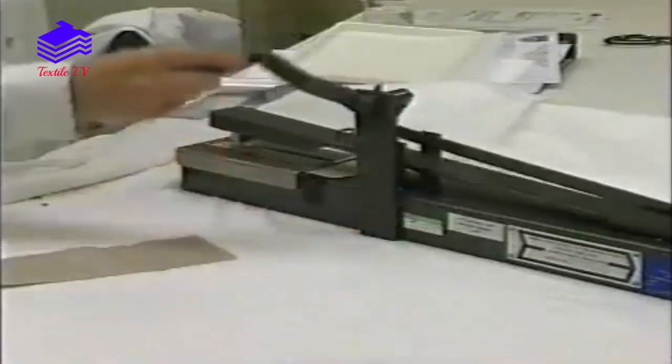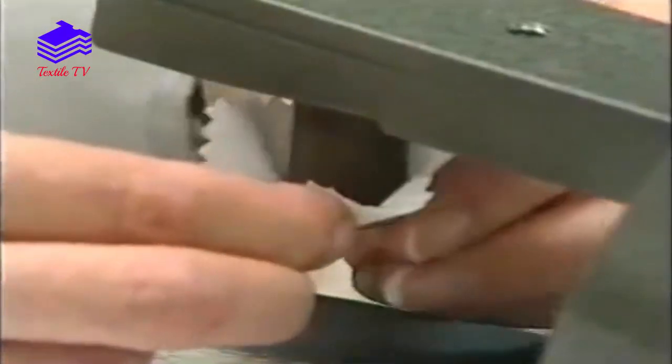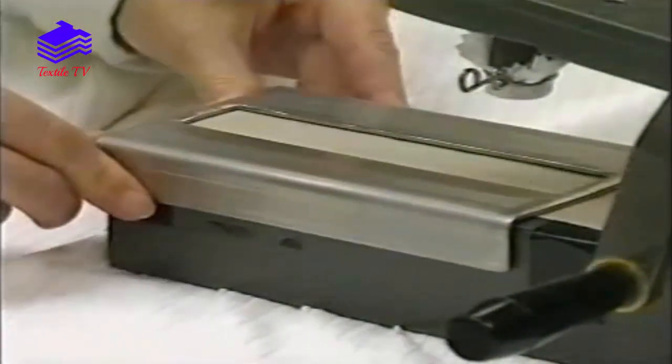The effectiveness of rubbing is assessed by using a crockmeter, whereby a piece of cotton fabric is rubbed against the test specimen under a set pressure for a specified number of rubbing cycles.